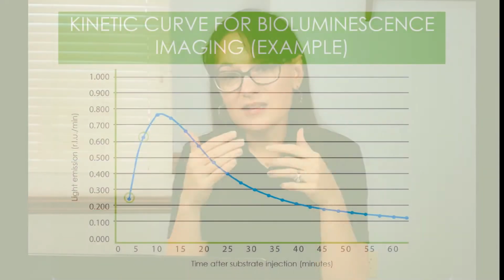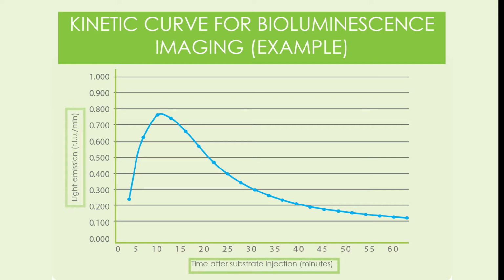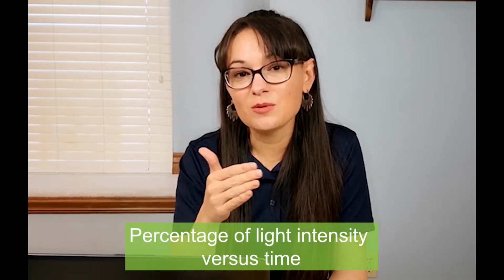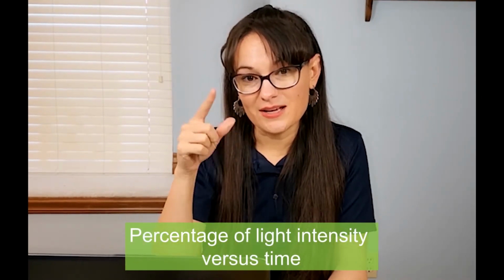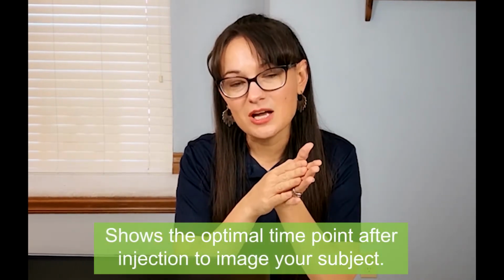When doing imaging, the curve is generated by taking a series of measurements that measure signal intensity, and it occurs over multiple time points, plotting that intensity in relation to time after injection. Results from your series of images will be plotted where relative light units will be represented on the y-axis and time after substrate injection is represented on the x-axis. Some imaging acquisition programs will plot the kinetics based on percentage of light intensity versus time rather than the relative light units on that y-axis. But ultimately, the kinetic curve provides a way for you to identify the most optimal time to image your subject.